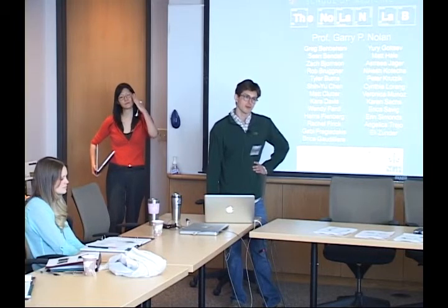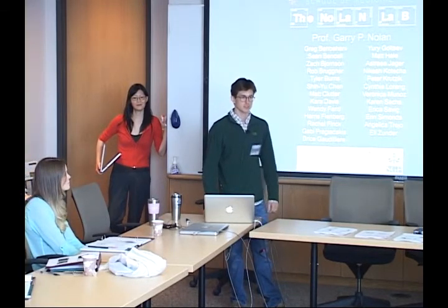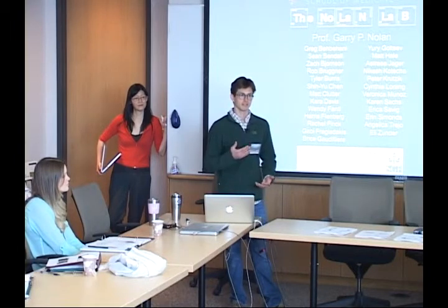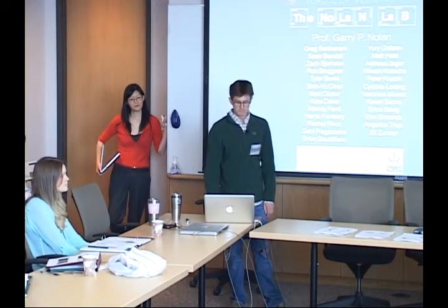I also have another question too. So you said you labeled 50 micrograms at a time. Yeah. Is there any changes to the protocol at all? Yeah, there are some changes, and we can chat about that. It's mostly just scaling things up, but there are a couple things to tweak. Mostly, you just want to do a lot more washes because the volume you're resuspending things in is. Yeah, exactly.